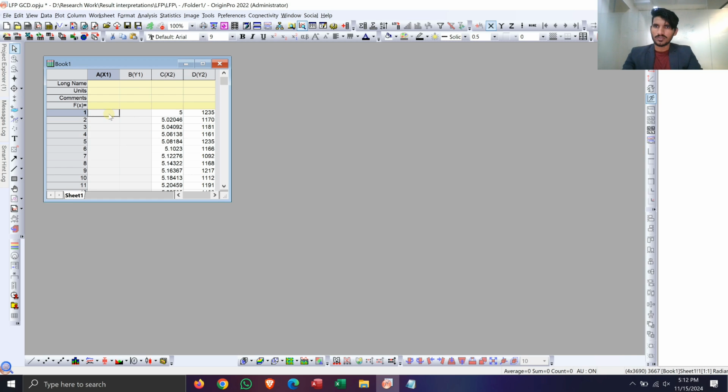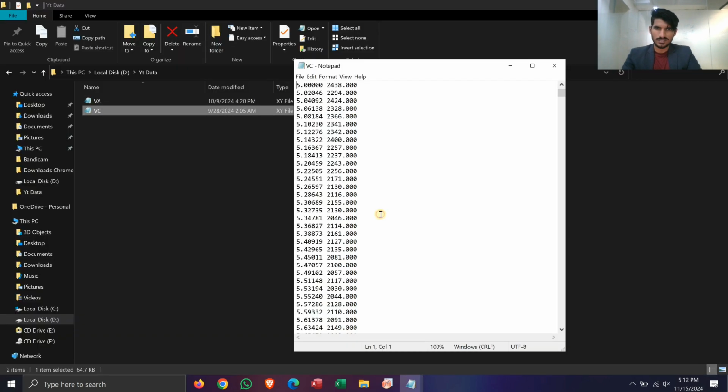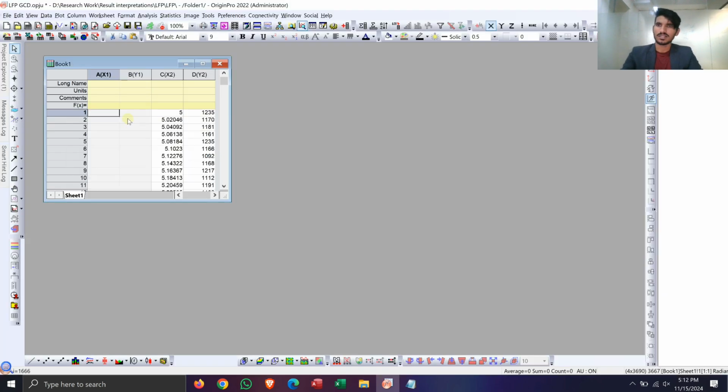Now I am going to paste the second XRD data here. Let's just say that this is the second XRD data. I'm going to copy it and place it here. Now we have to give it a name. I have given it the name VC, and the second one I have given the name VA. What I've done is just give them the names.